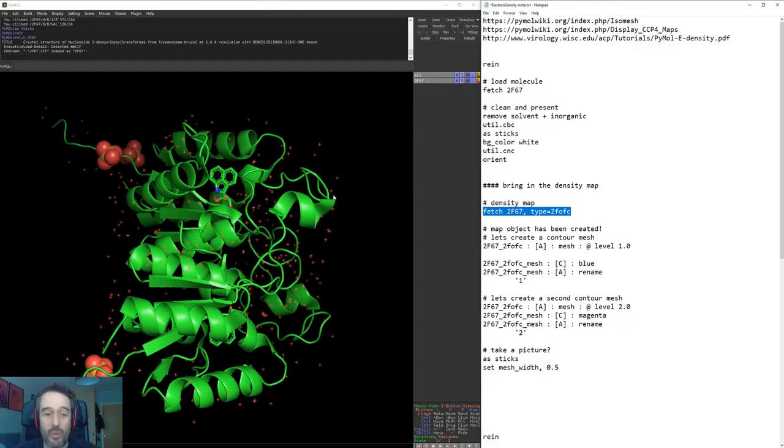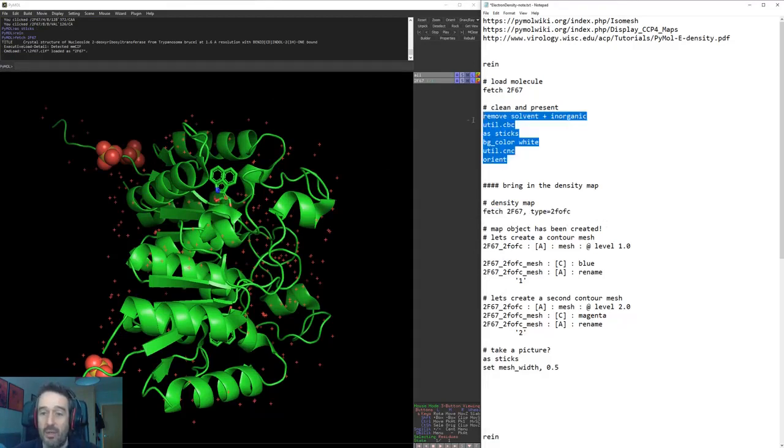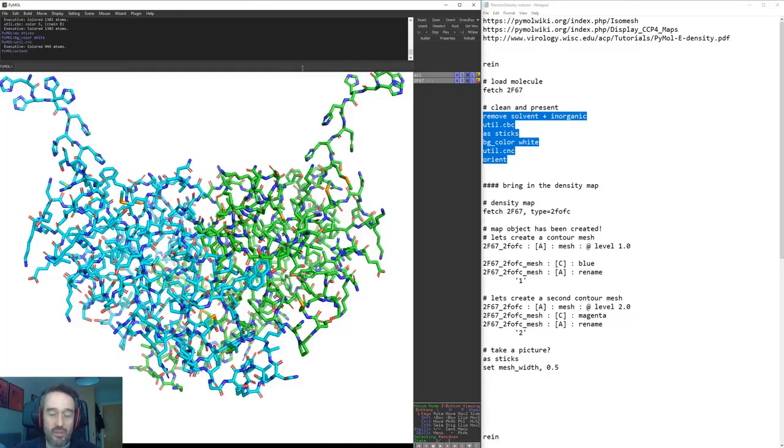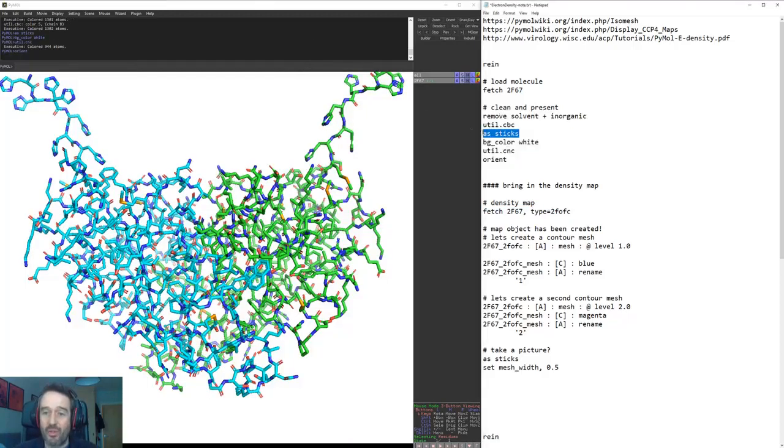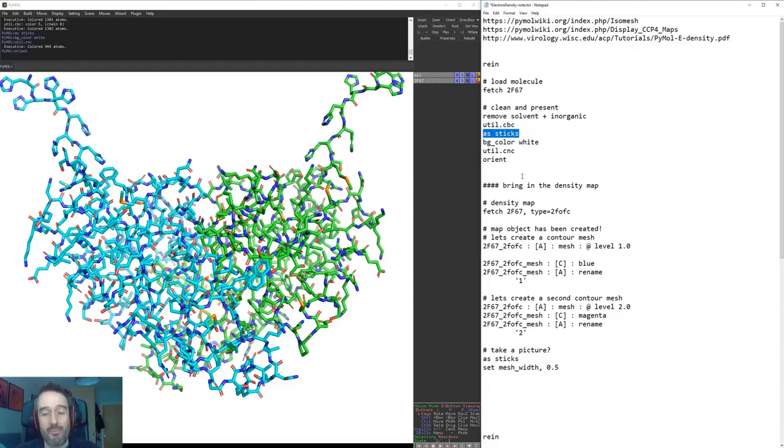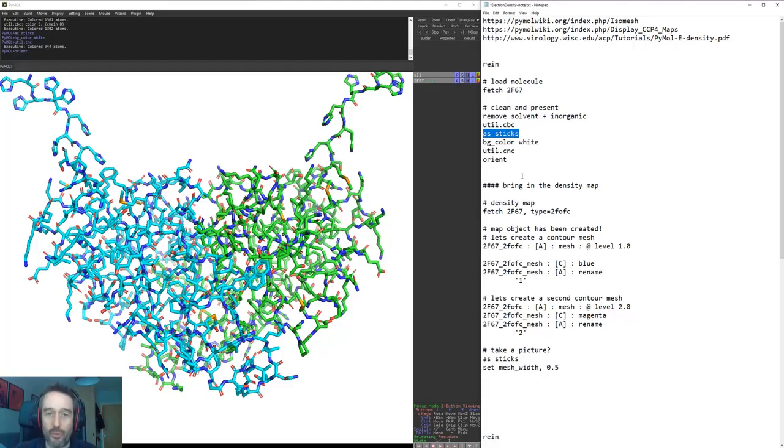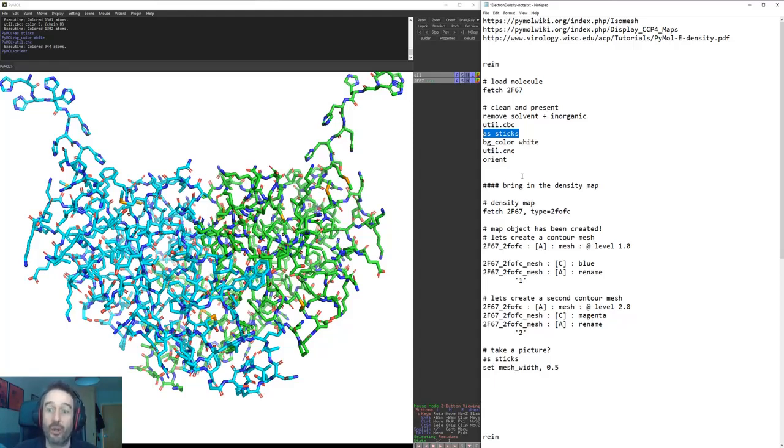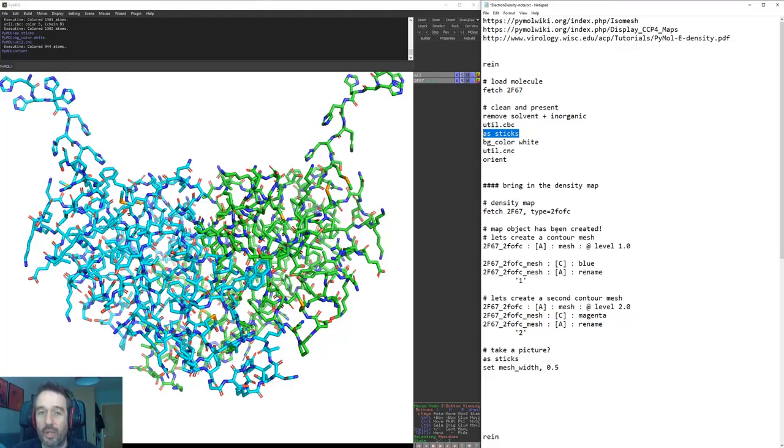First what we'll do is clean up our PDB using some of these standard commands which hopefully you've seen before. This time what I've done is I've took away the cartoon and just left the representation of sticks. This is because we're going to be looking at the electron density and there's no point in having the cartoon models there and not showing the backbone structures, because there'd be sections of density that aren't represented by the atoms we're interested in.